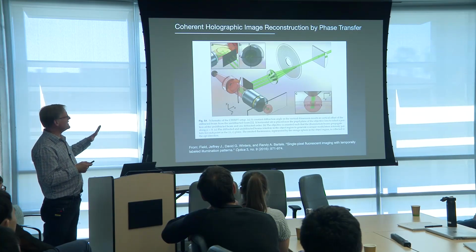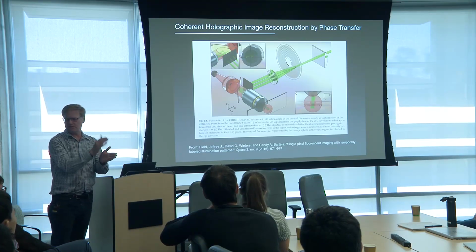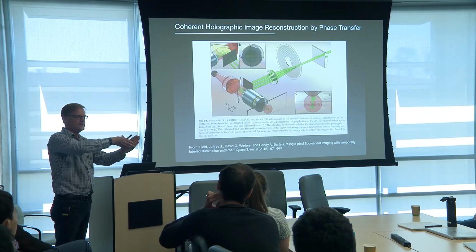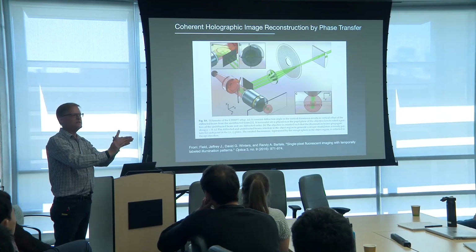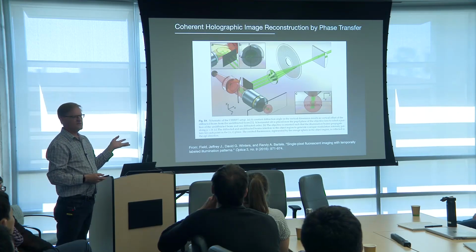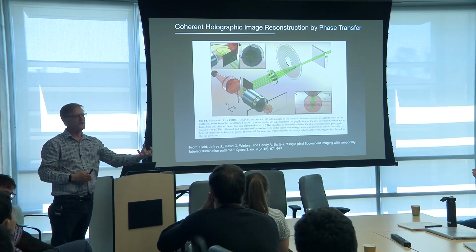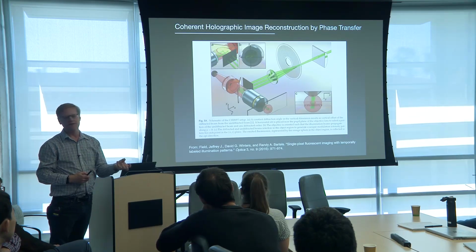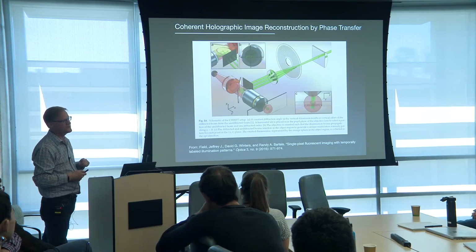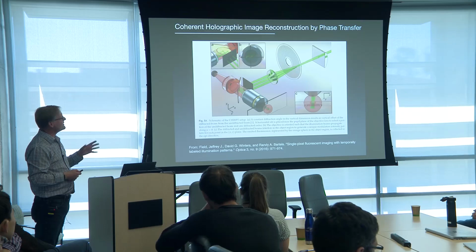And then they actually end up creating light sheets in the axial direction. So now you've got 2 light sheets going deep into your sample, and the angle of the 2 are changing with respect to one another. Their idea is that they can use this to do light sheet imaging in 3D at depth, but you're detecting it all through the same objective. A lot of light sheet methods you've got to look at orthogonally. Here, in principle, you could do it through the same objective. And I'll show you what the method is.